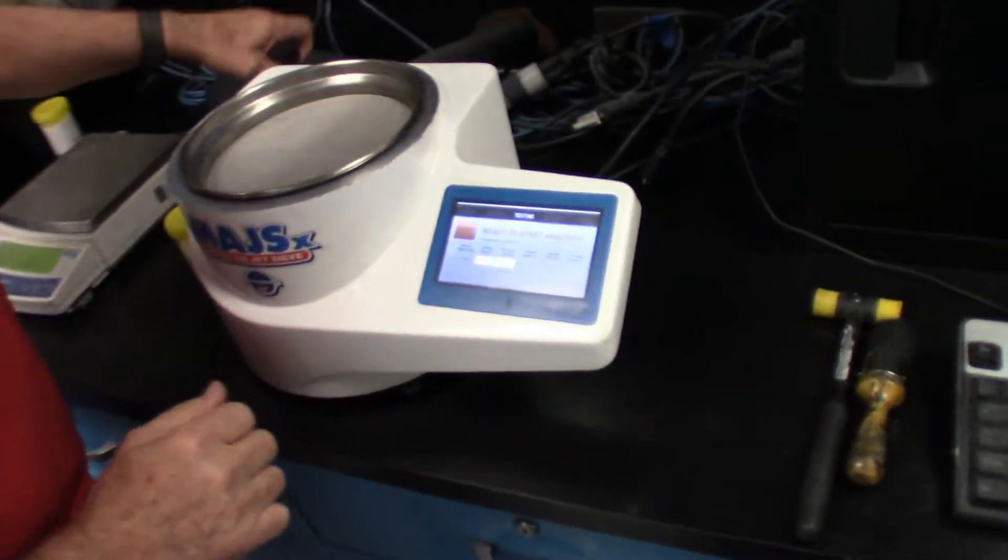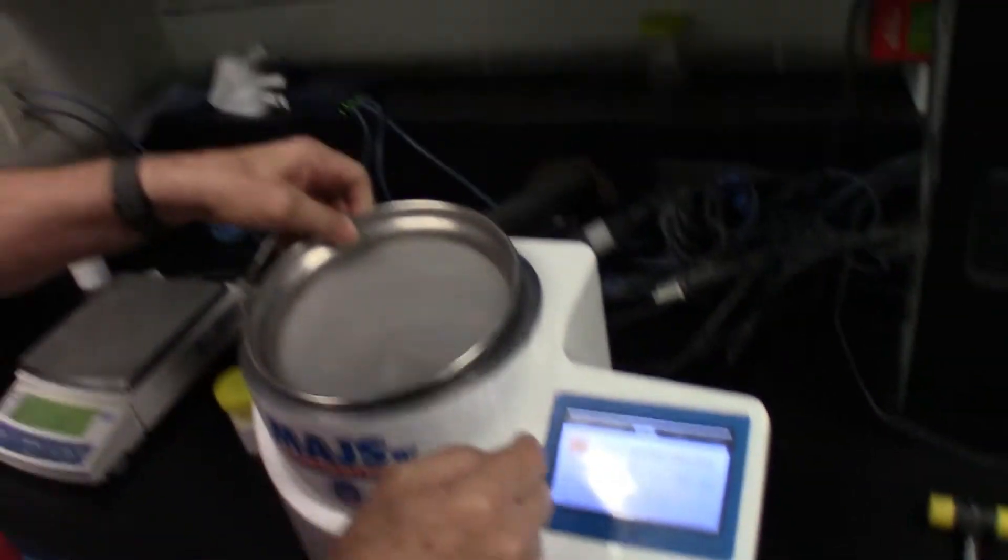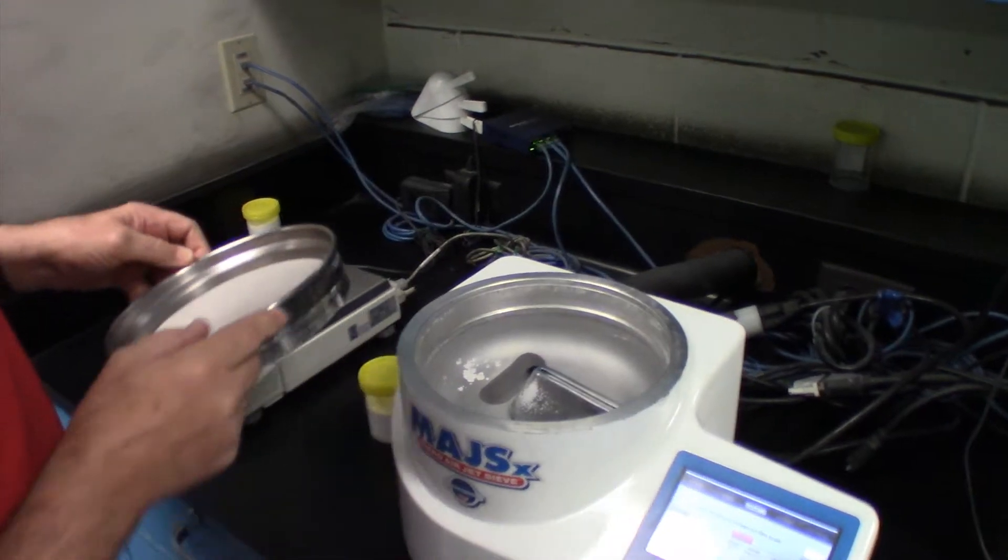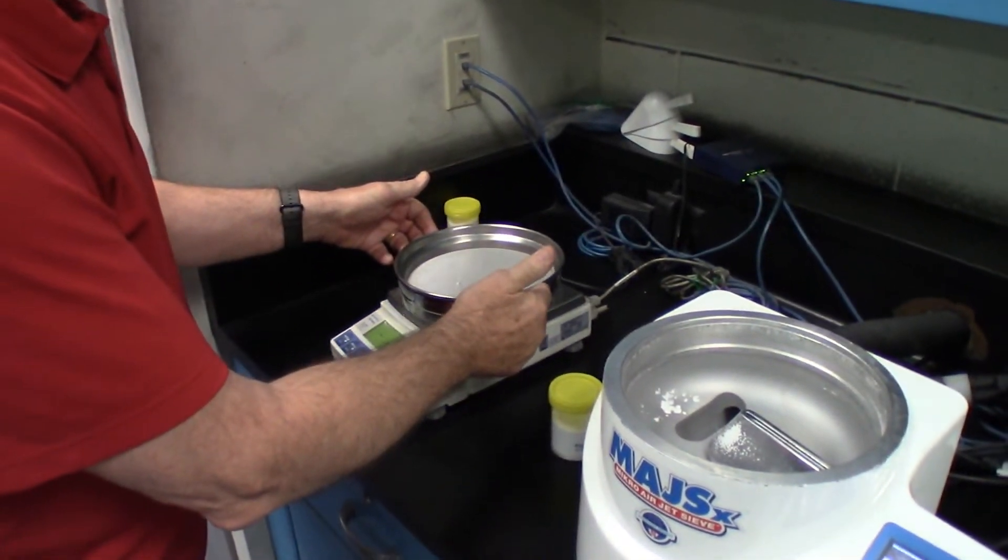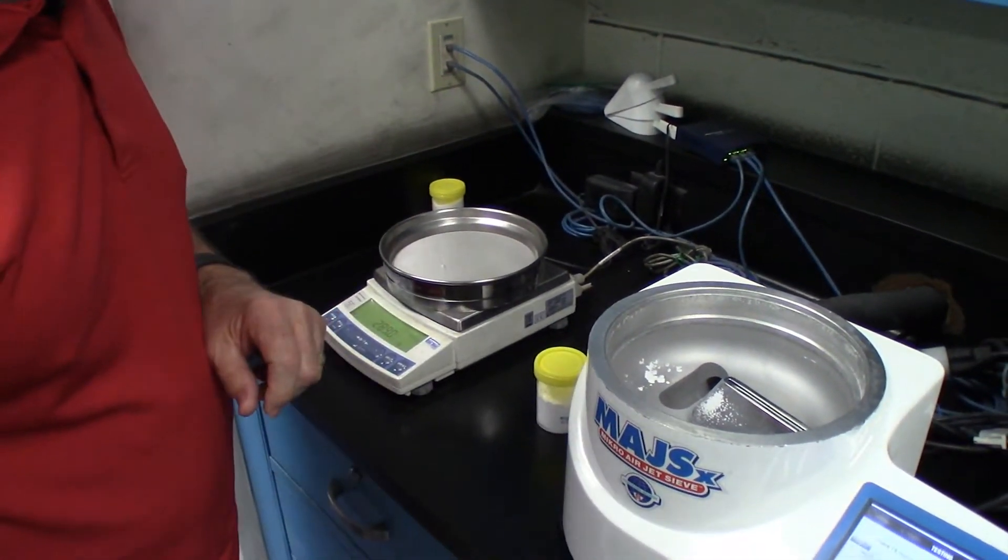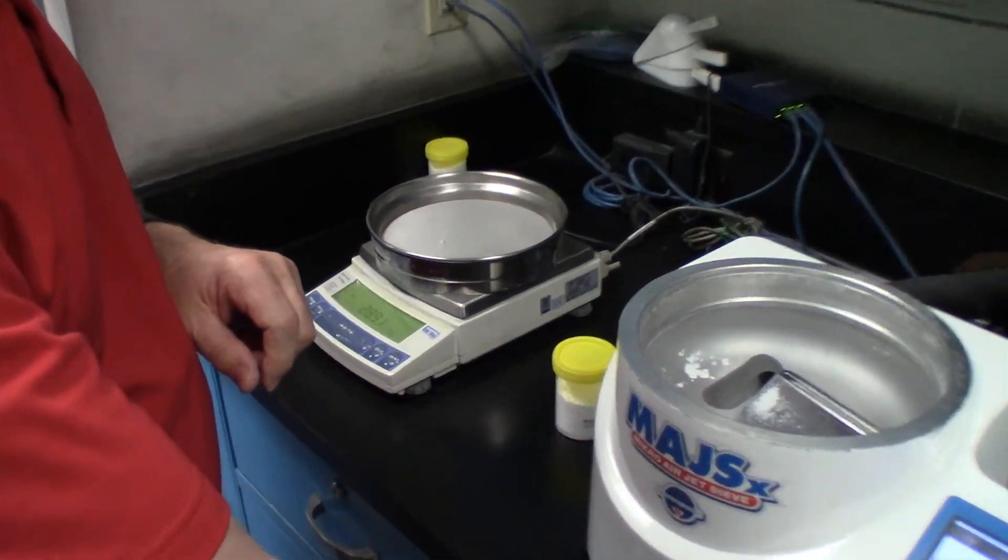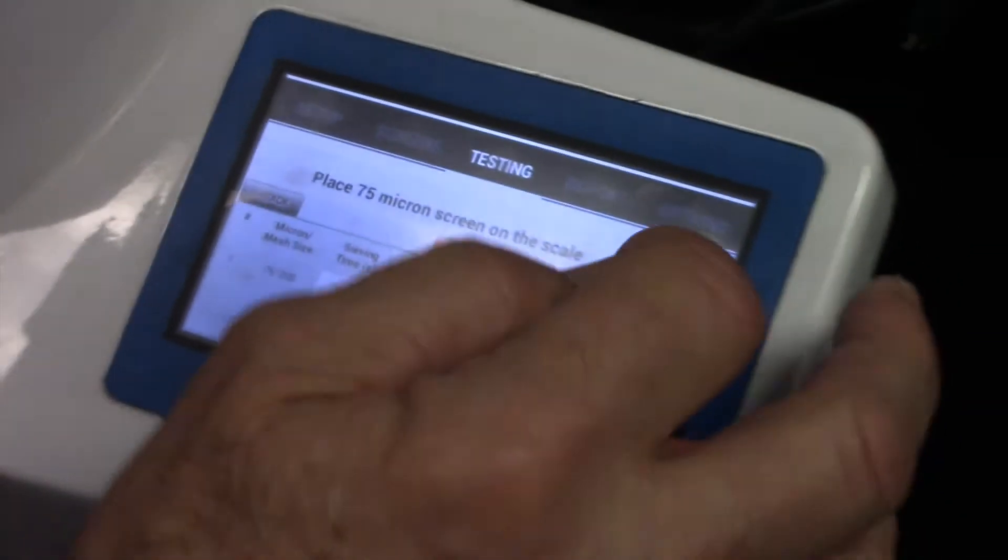We'll advance the system here. We will begin by pressing the button, weighing the empty screen, which weight will be displayed here. Once they match, press next.